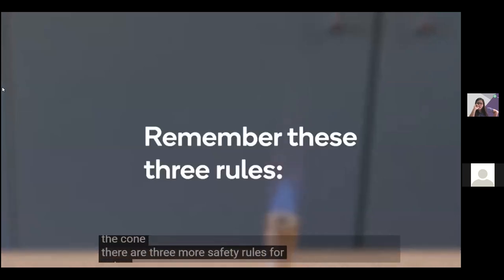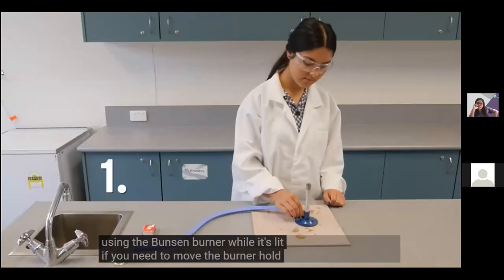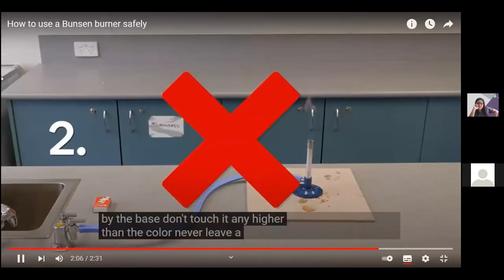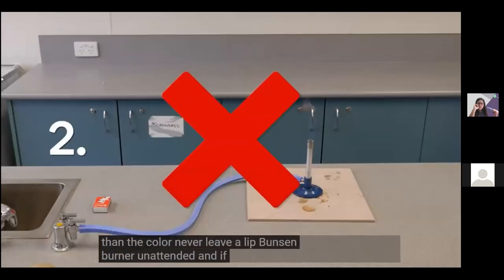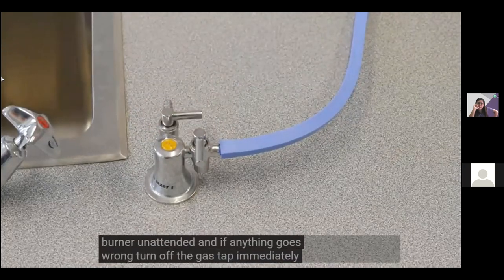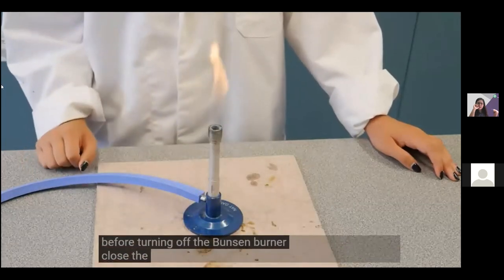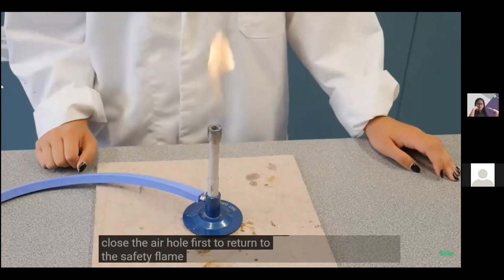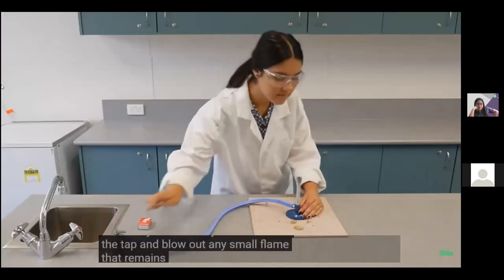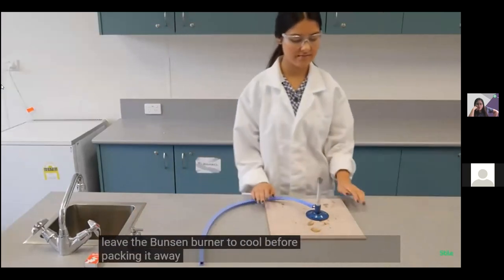There are three more safety rules for using the lit Bunsen burner: if you need to move the burner, hold it by the base and don't touch it higher than the collar. Never leave a lit Bunsen burner unattended. If anything goes wrong, turn off the gas tap immediately. Before turning off, close the air hole first to return to the safety flame, then turn off the tap and blow out any remaining flame. Disconnect the hose and leave the burner to cool before packing it away.